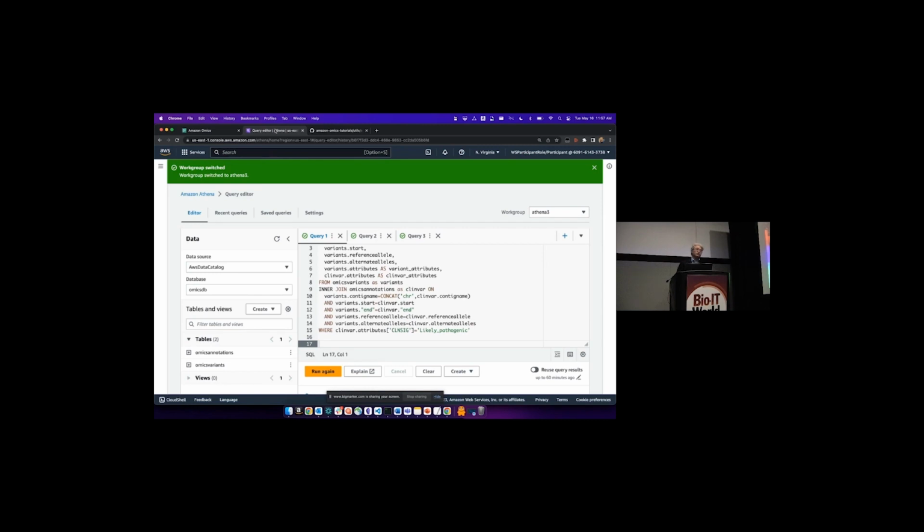So part of this is how you want to arrange your data. A variant store is designed to hold multiple samples, so you can import multiple VCFs into that variant store and then query it. Think of it more like a normalized table where you have sample ID as the key, so you can sub-select from that.